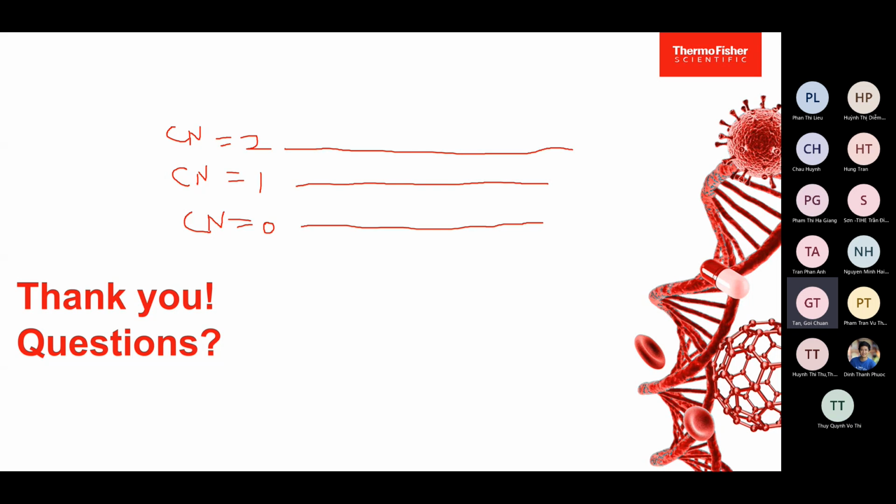So if this is a copy number 2 signal, in a copy number 3 signal you should observe that the signal is higher, because we measure the intensity. Yes. That is exactly what I am thinking about.